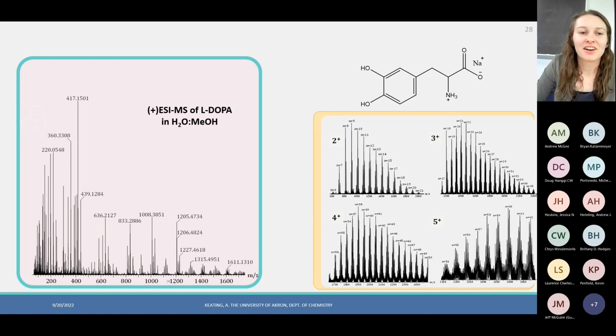Yeah, it's been tough. At about 4 hours, they start to precipitate out. I did a study with someone in polymer science, and she was studying this with dynamic light scattering. At about 4 hours, the aggregates or species that are forming reach a particle size that is not suitable for our ESI capillary.